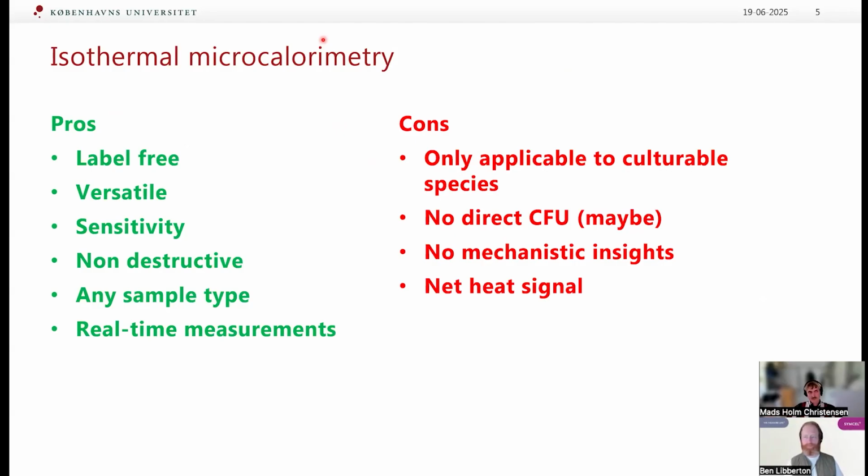And also you essentially culture the bacteria in the system while doing your analysis, so you can do downstream analysis on the bacteria afterwards to complement the microcalorimetry. And you can basically use any kind of sample type that you want. In principle, you could dump in the whole biopsy from the patient and see what that gives you of results. And then you have real-time measurement.